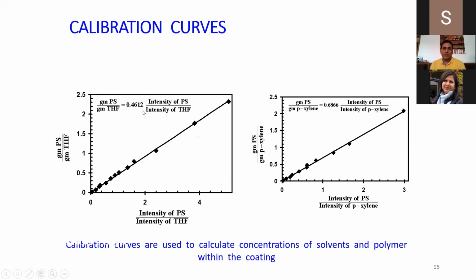And then you plot this one. So you have prepared polystyrene tetrahydrofuran samples of different concentrations in the sample bottles. You can do this with the confocal. You can put the sample in your quartz bottle, quartz cuvette also, to get the spectra there. So you can do everything with the confocal: powder, liquid, solid, everything. Even these days gases are also coming.